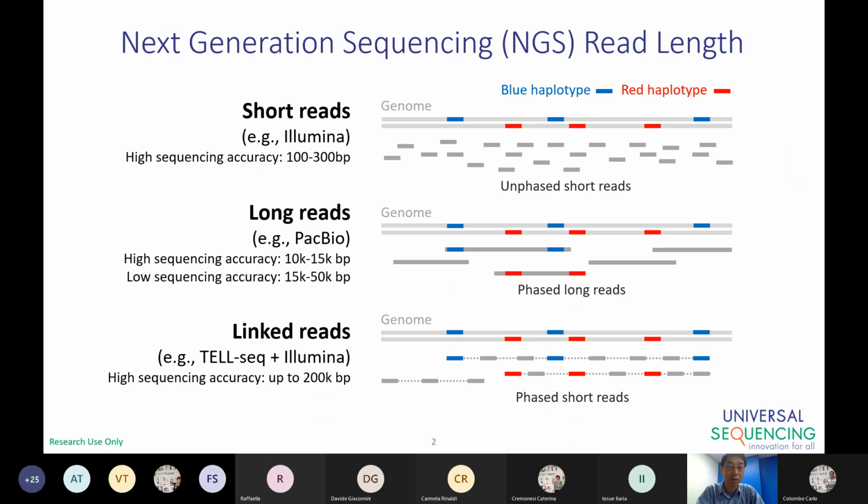I think everybody here is very familiar with NGS sequencing. Currently, the short-read sequencer is the most popular one. It's higher throughput, higher accuracy. However, there is a limitation with short read. For this particular application, we look at how to phase haplotypes, because with a shorter read length, it has limited capability to phase SNPs pretty far away.